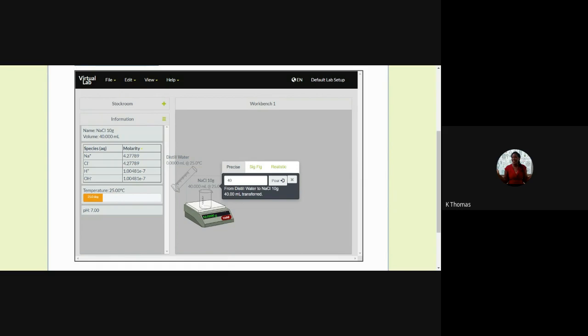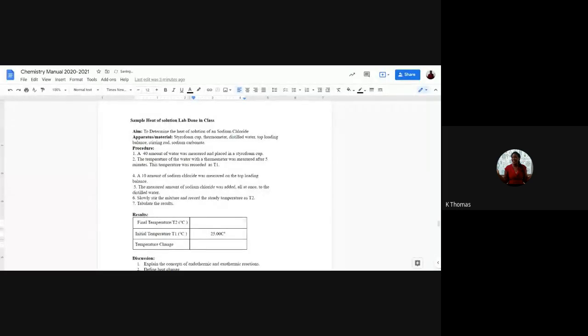Right, so I recorded it, I captured it. The lowest temperature I can see from the video is 21.10. So it went all the way down to 21.10 degrees Celsius. Really happy with that mark. We can see that indeed there was some temperature change. And it's not 21.0 flat, you know, it's 21.10 degrees Celsius. So I'm just accounting for that right now.